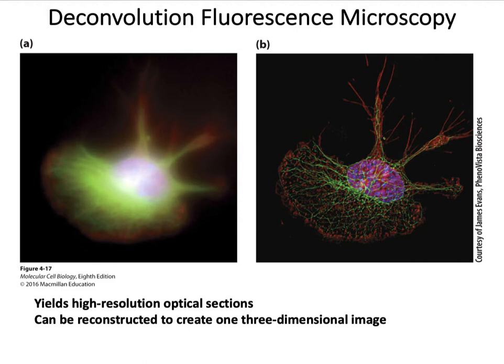So only the sample at the 3 micron plane is perfectly in focus. But the 1 and 2 micron levels above the 3 micron slice are out of focus. The same way, the 4 and 5 micron planes below the 3 micron level are out of focus as well. So when you are visualizing the 3 micron plane in perfect focus, out of focus light from the planes above and below the 3 micron plane is also contributing to the image, and you get an overall blurry image, just as shown on the left side of the figure.